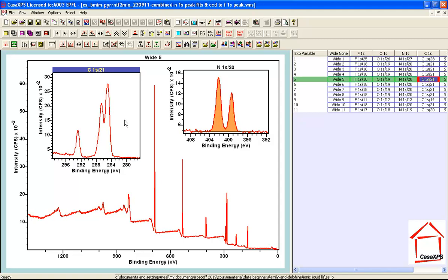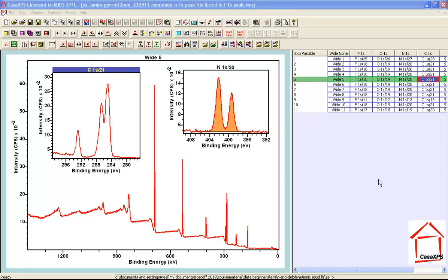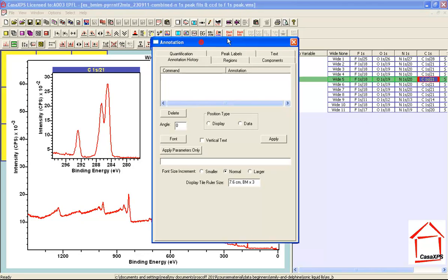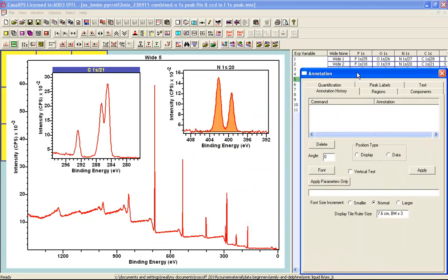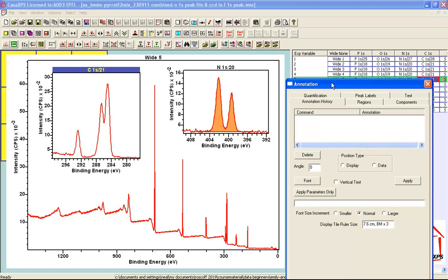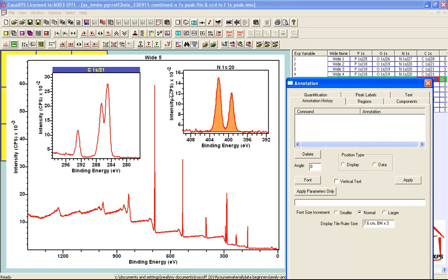Now each one of these tiles represents a display tile that can be used for performing various actions such as peak fitting or adding annotation to data. So let's add some annotation to these data. If we select the annotation dialog window then the VAMAS block that will be acted upon is the one with this bar across the top.